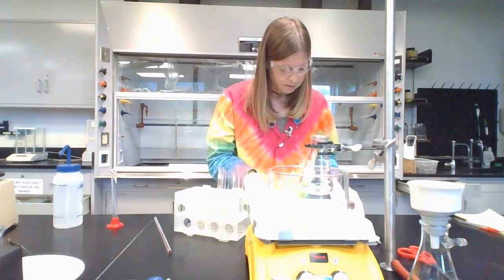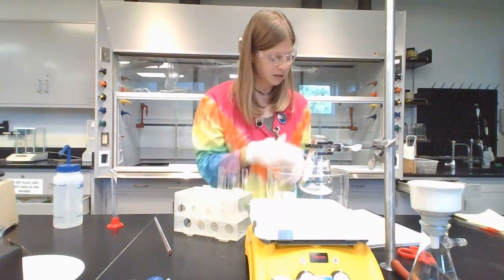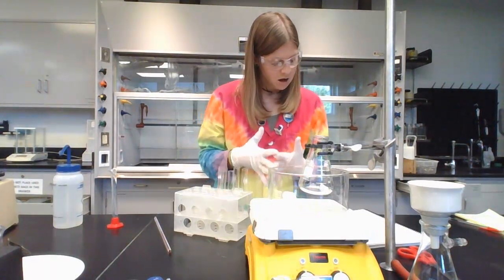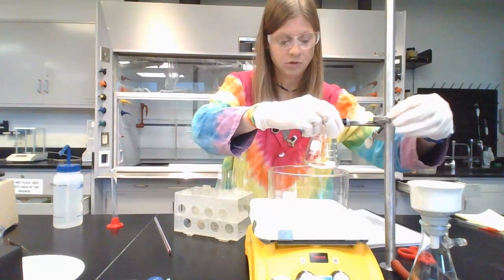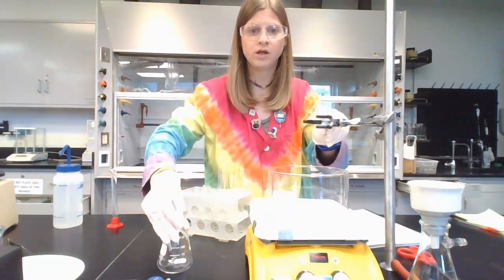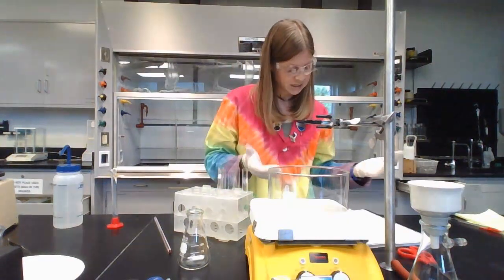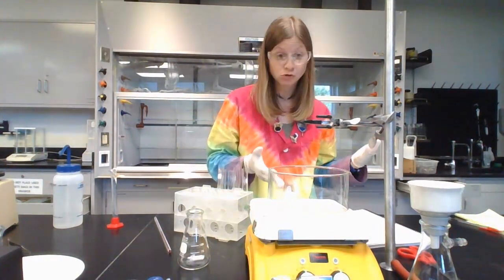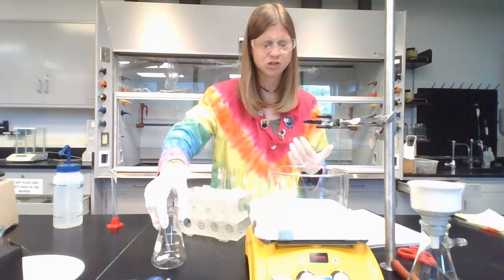Okay. So once it's been 20 minutes, and while that's mixing, you're able to remove the Erlenmeyer flask from the water bath. You can turn off the hot plate. Okay. And then you're going to remove it from the clamp and just let it sit to slowly cool to room temperature. So it says in the lab, allow it to cool to room temperature so it's no longer warm anymore. It's just like the temperature of your hands.